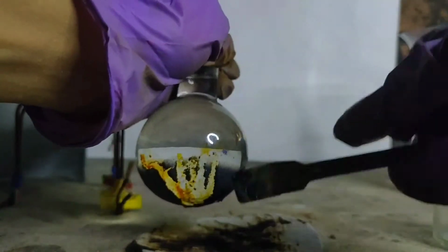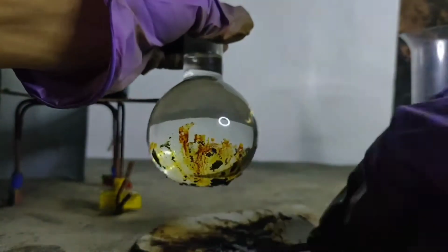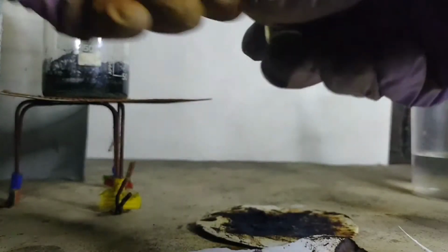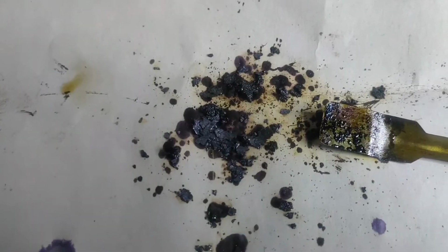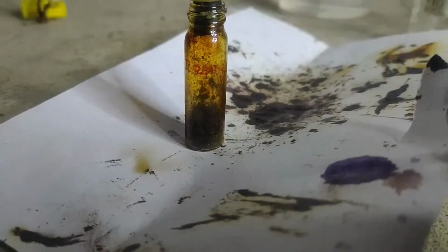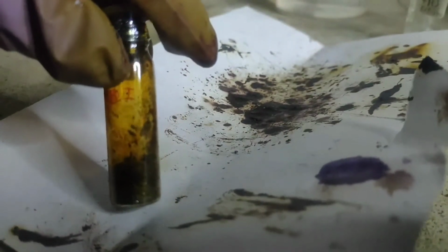I scraped them off using my spatula and transferred them on a filter paper to dry them. So these are the crystals that I have got in my second run. These were also transferred into the vial. So I didn't show the third run, but these were the crystals that I got in my third run. I also transferred them into my vial, and this was the final yield of iodine that I have got.